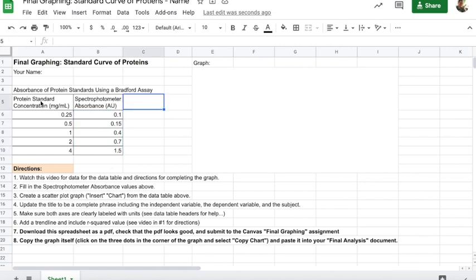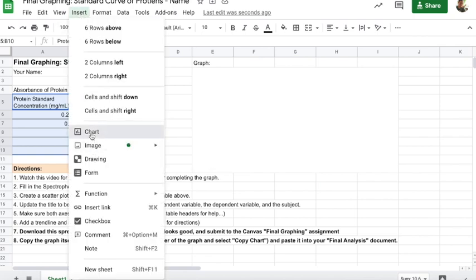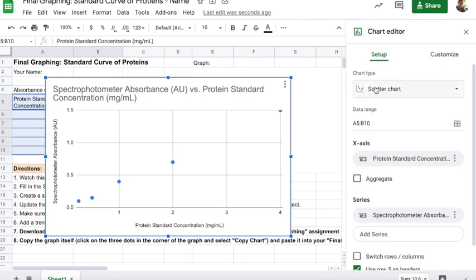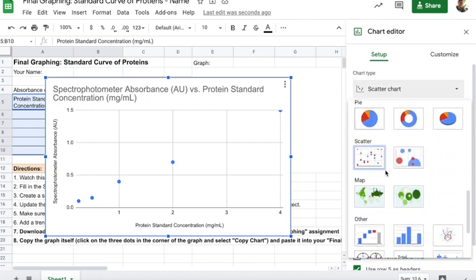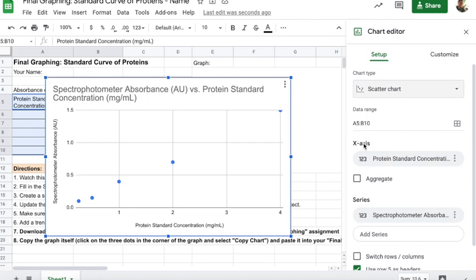First, highlight the headers and all of the data — make sure you do not highlight the title, just the column headers and the data itself. Then go to Insert Chart. Make sure that a scatter plot pops up — you do not want a line graph. If your chart looks different, go to the setup menu and change the chart type, scrolling down until you find scatter plots. Make sure you have a scatter plot before moving forward.